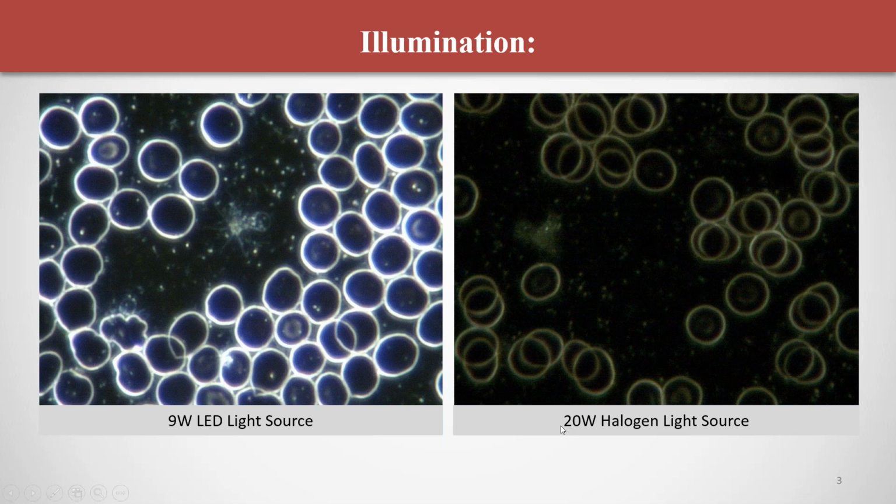Okay, thank you. So you won't really be able to do a proper analysis at all? Not at all, and that's with just the illumination. So even if the microscope has high quality objectives, the right type of Darkfield condenser, a very good quality camera, all the other specifications could be fine, but if the light source is not providing sufficient brightness, then you really won't be able to see much at all.